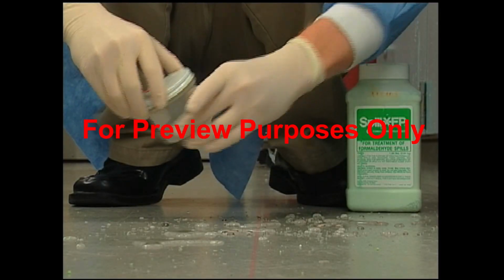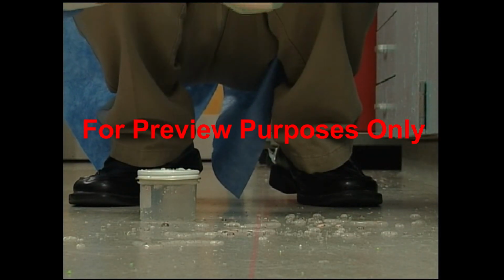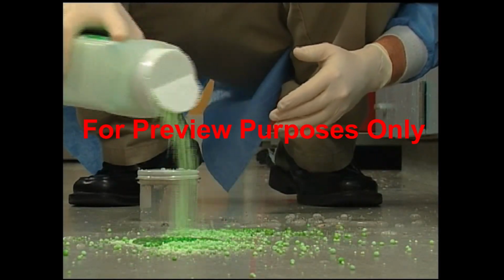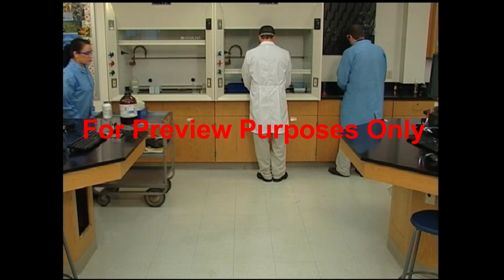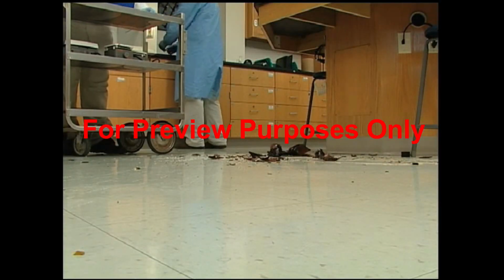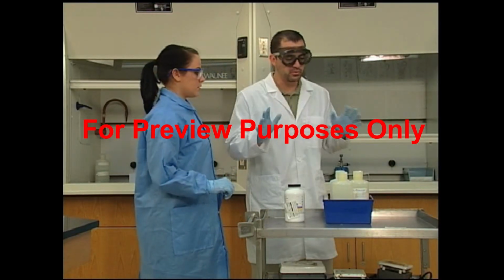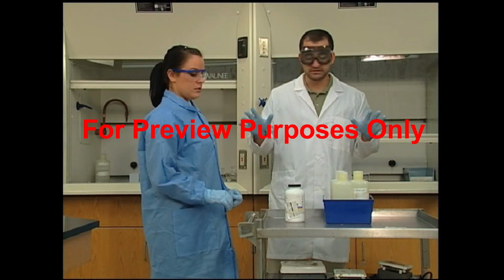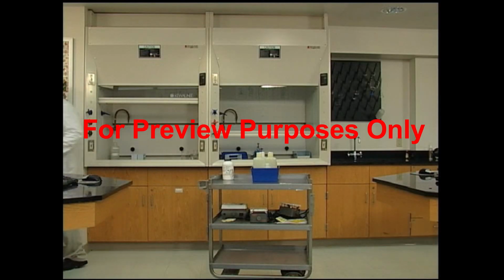In the event of a small spill, soak up the liquid with an absorbent material like vermiculite or a spill pillow. Place the waste into a properly labeled and sealed container for later disposal. Do not attempt to handle large spills of formaldehyde. Formaldehyde is toxic, and the fumes from even a dilute solution can overwhelm you. Alert other personnel in the area and vacate the laboratory immediately. Then call for assistance.